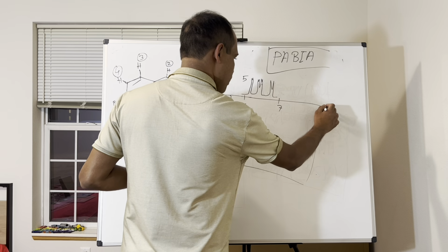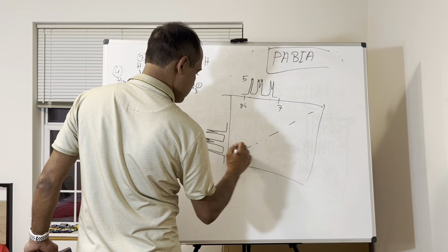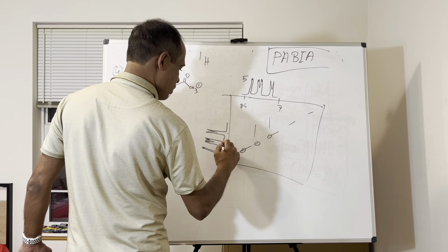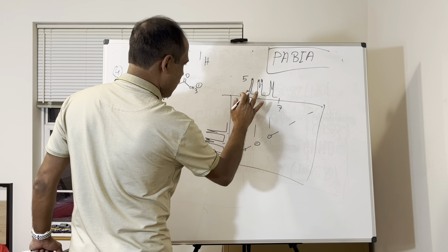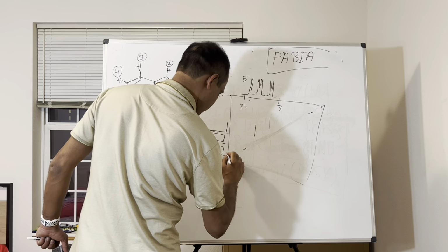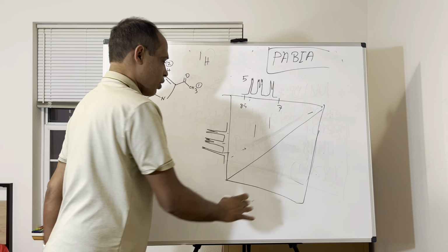So if you draw a diagonal, it will be like this, and this. You will see the same peak in the diagonal, same peak in the diagonal, and same peak in the diagonal. Maybe a little bit here. I drew it far away. Yes, now we'll say it the same way, okay?